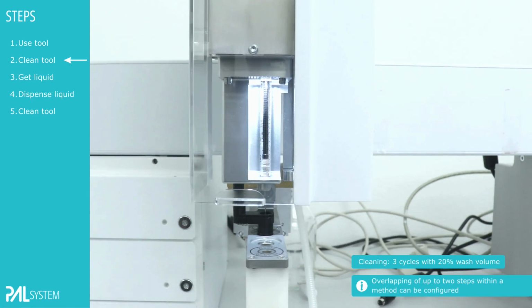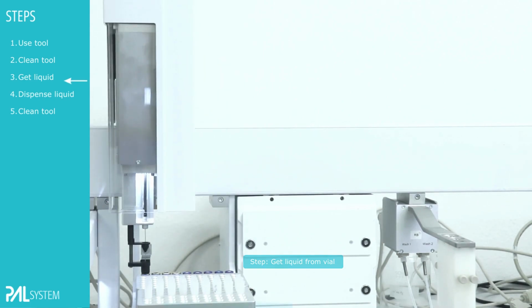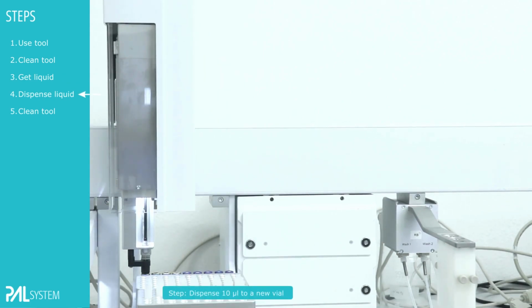For more complex methods, you can overlap different aspects that take more time in a method, for example an agitator step. For that, you will find an overlap option in the top taskbar where you can specify the overlapping. A set of steps will then be visible for you to adjust in your method.